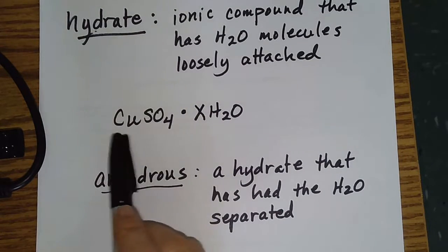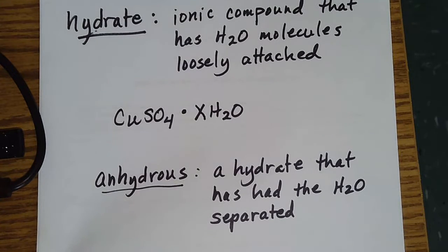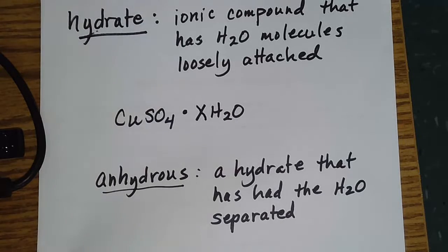Okay. So the copper 2 sulfate is one part, the water is one part. We need to get the masses of each of those. And then we can convert the masses to what if we're doing an empirical formula? Masses to moles. And then how can we get the mole to mole ratio? Divide by the smallest and then go from there, right? Hopefully we won't have to multiply to a whole number, because I'll tell you, this should be an understood one here. There should only be one of these, but we'll see what happens tomorrow.